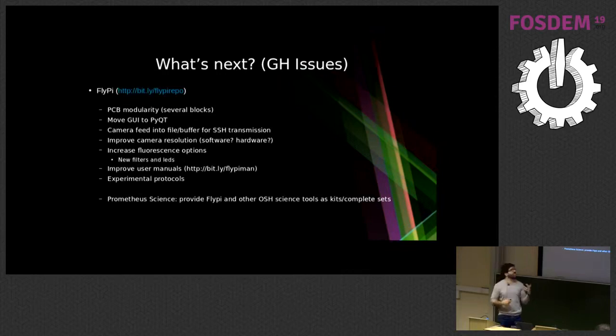So this is an open source tool for documentation, which is very similar to what Prusa has for their printers. So you have like a photo and then a little text description, and you can go step by step. And this is all on this link. And we want to try to apply this for different areas other than neurosciences.